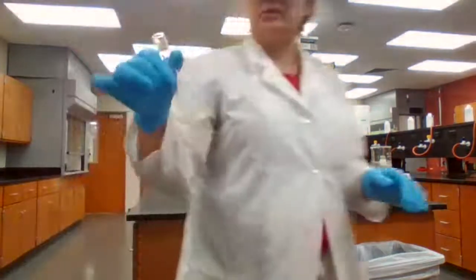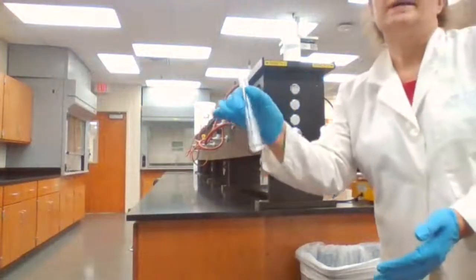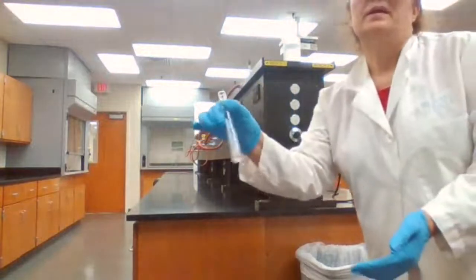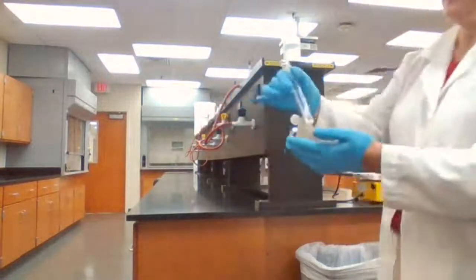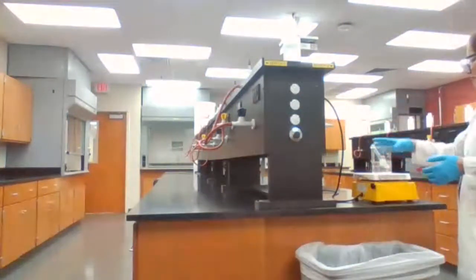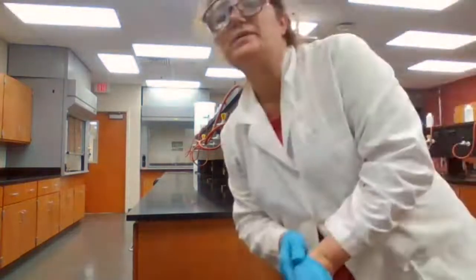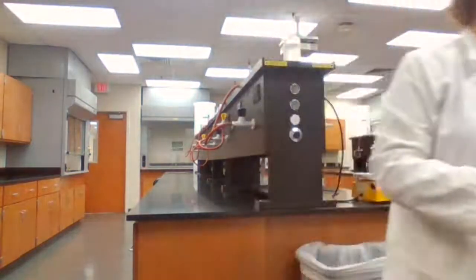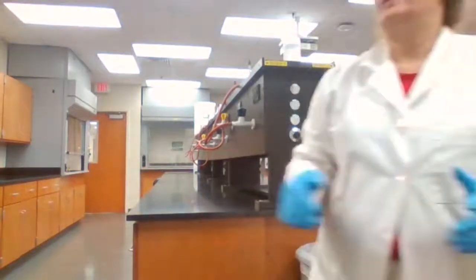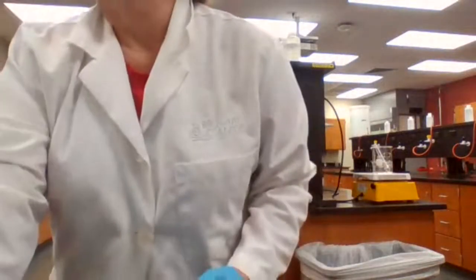I added the 8 drops of the sulfuric acid, and I'm going to place it in hot water for 10 minutes. Very good. Thank you for your help. I'm going to leave it in the hot water for 10 minutes and start the timing at this point. Okay. And we can move to the second part of the experiment.